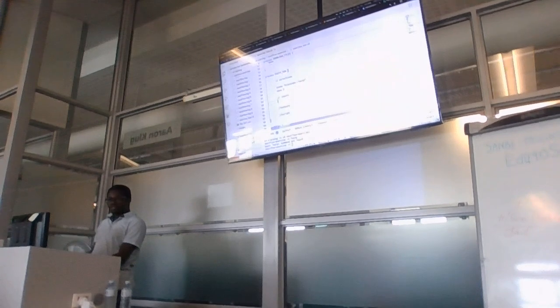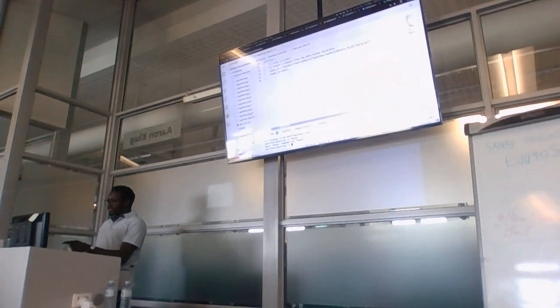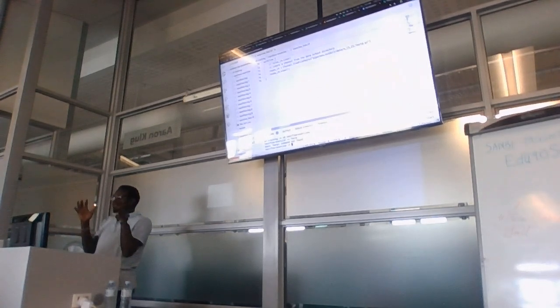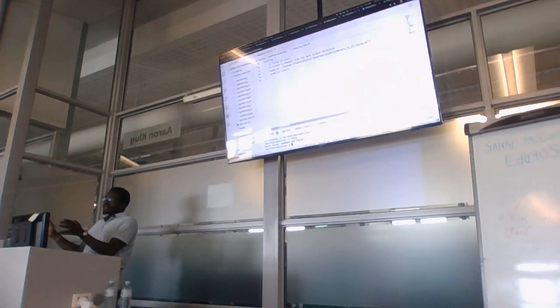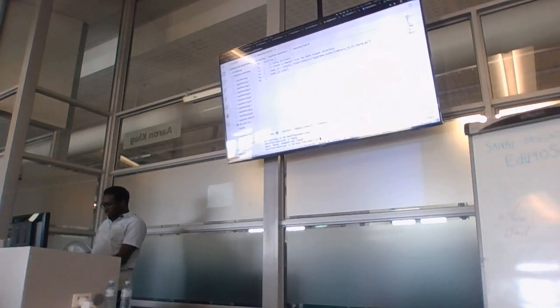Our inputs are going to be, remember, the channel we created here from the file pairs, a channel that has the sample ID and a list of the files, so the forward and the reverse. You can run the script again to see what the output is.